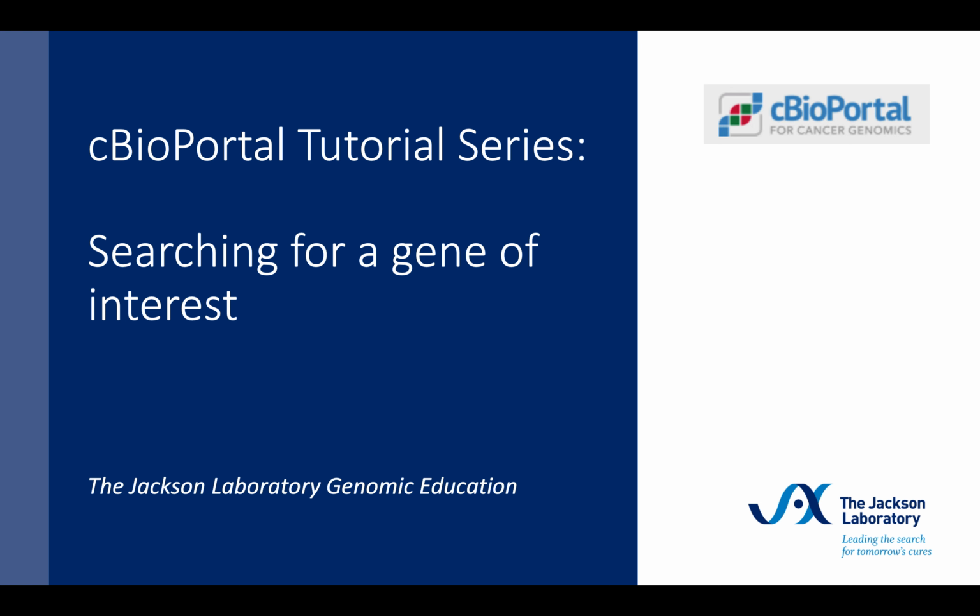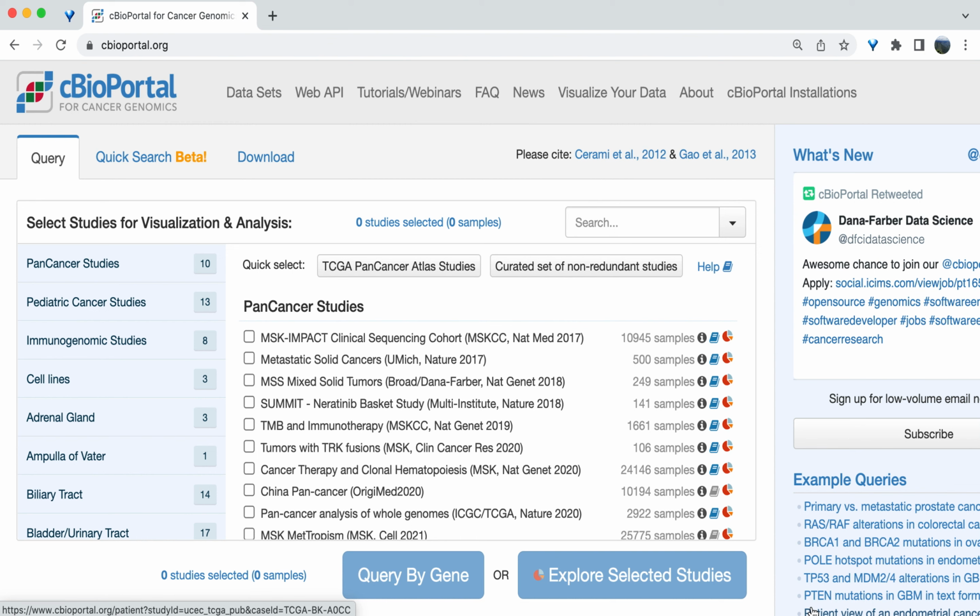This short video demonstrates how to search for a gene of interest on the cBioPortal database. Using the cBioPortal, it is possible to search for a specific gene within a study or within a group of studies. Because the studies that are housed on the cBioPortal include genomic data, and often report gene variants, it is possible to find the studies or specific patients who have variants, amplifications, or deletions in a gene of interest. To do this, we will use the Query by Gene button at the bottom of the page.